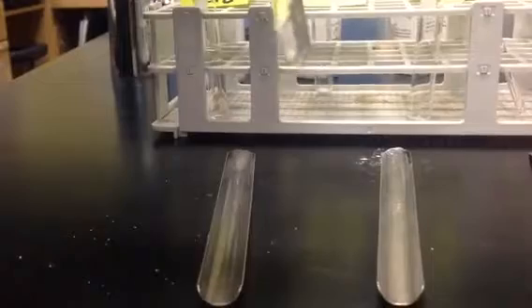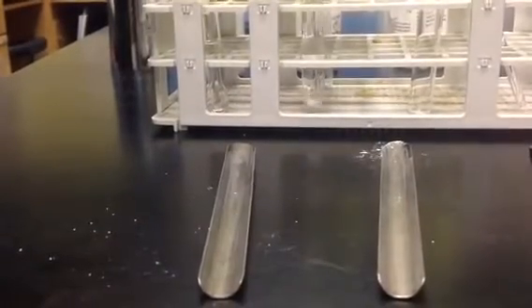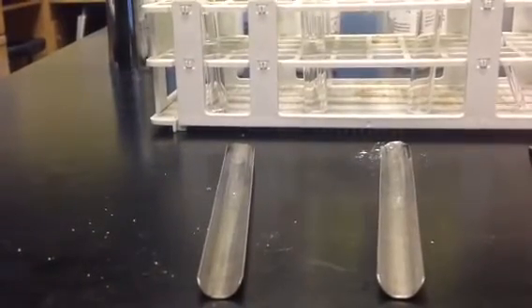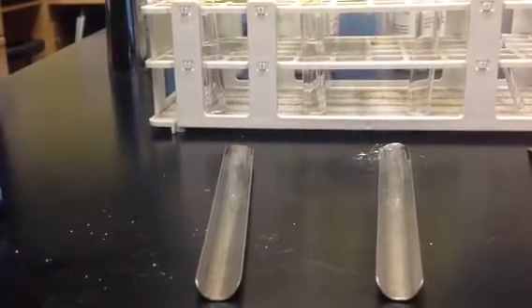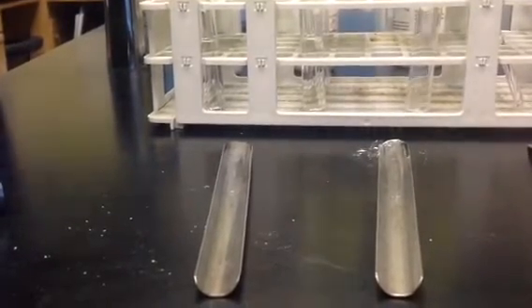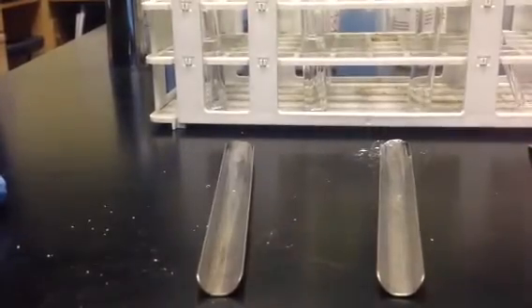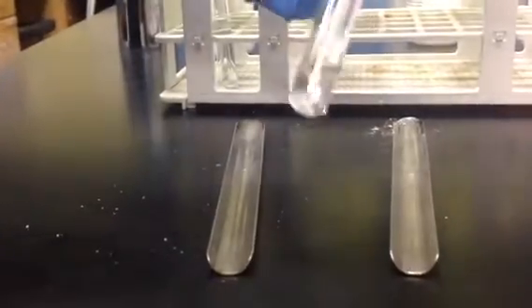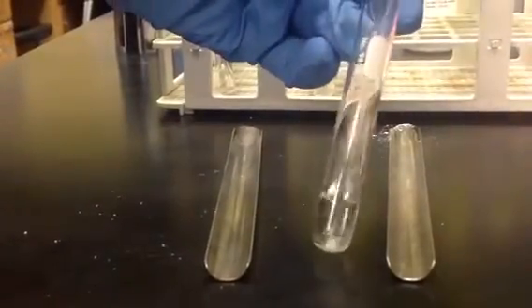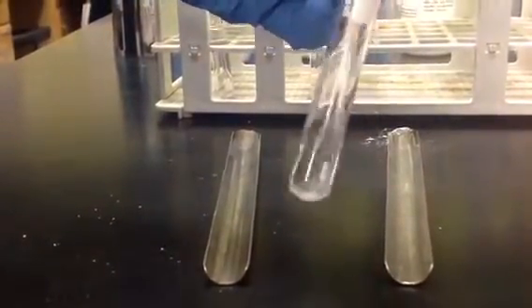Okay. So it also will dissolve acetaminophen. Now to try it with the silica gel. Here's my stirring rod for the silica gel. You can see the silica gel at the bottom.